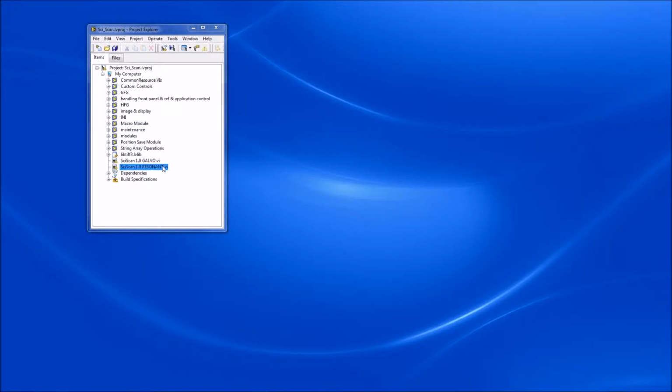We also have a few other interesting videos online which will show you how to unzip the downloaded file and how to then confirm your INI settings. None of that will be covered here in this video, so please refer to the other videos.